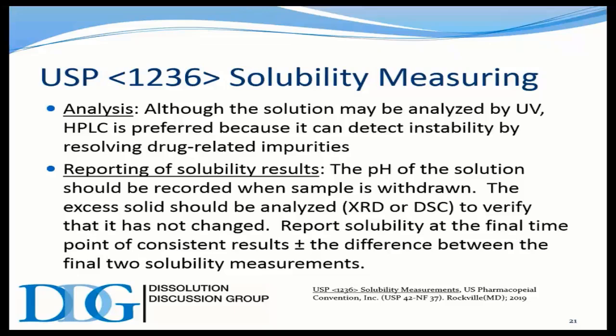I just want to follow up with that. Truly water, you can definitely have huge issues, but FDA discourages it for that exact reason. There's no buffering capacity. So the pH buffers that you'll see in USP are fairly rugged in most cases, and I agree with you. When we did it, we did not adjust the pH. We made note of it to see if that could cause some issues, or maybe we could modify our media to be a stronger buffer. But generally, it is very important to note.